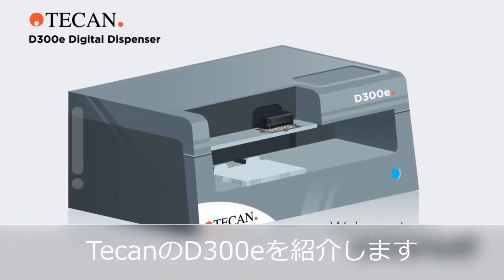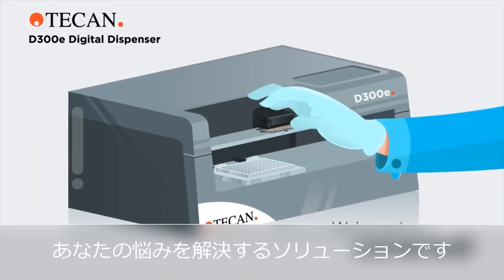Introducing the Tecan D300E Digital Dispenser — the solution to end your struggle.